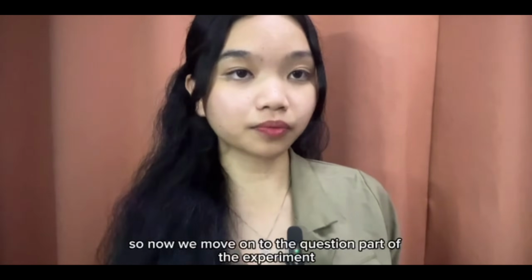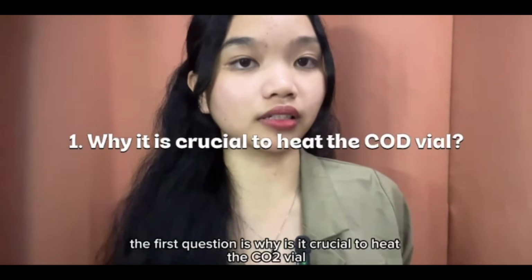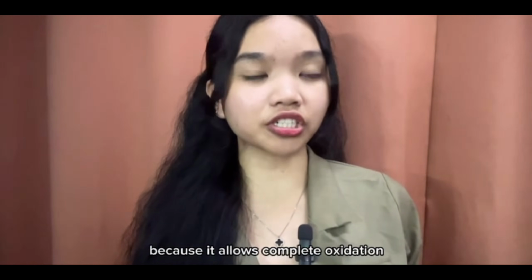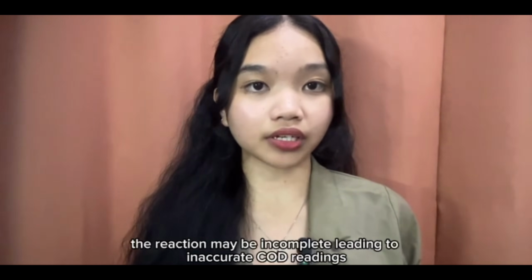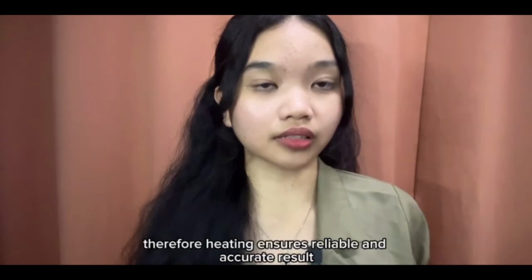So now we move on to the question part of the experiment. The first question is, why is it crucial to heat the COD vial? Heating the COD vial to around 150 degrees Celsius is important because it allows complete oxidation of organic pollutants by potassium dichromate. If the sample is not heated properly, the reaction may be incomplete, leading to inaccurate COD readings. Therefore, heating ensures reliable and accurate results.